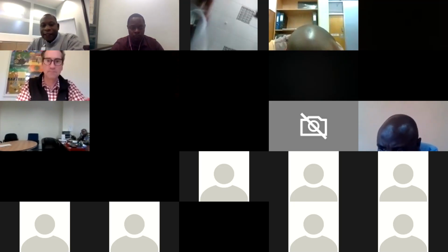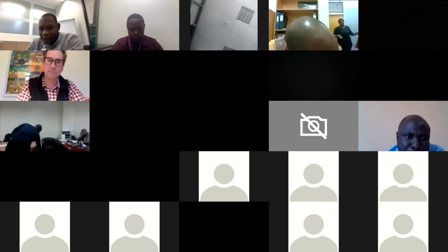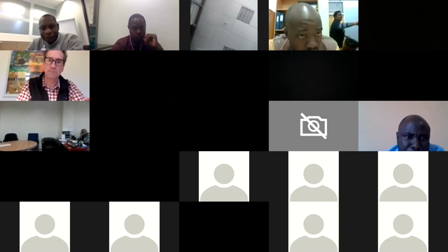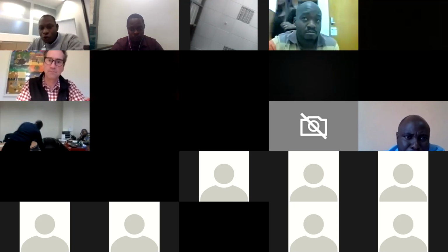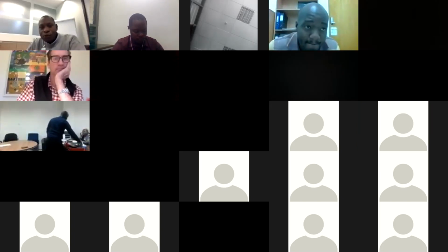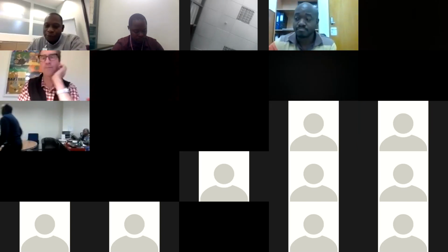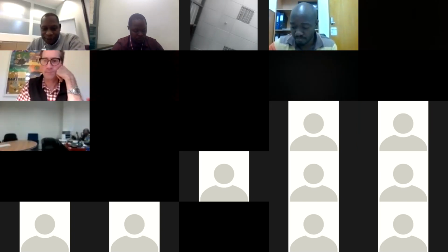And then Zambia is going to be giving us a case study of a module of the LIMS, which is called eLABS. That is helping to create a loop, to connect between sample collection up to the point when the results get back to the patient.